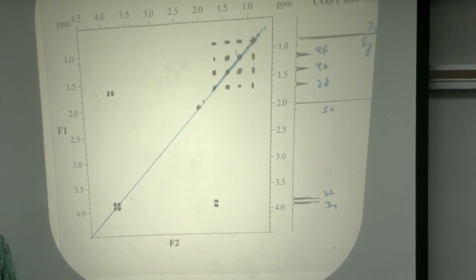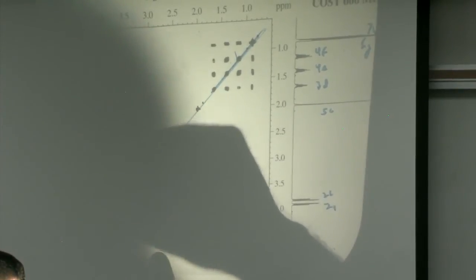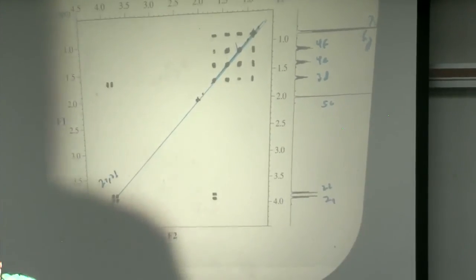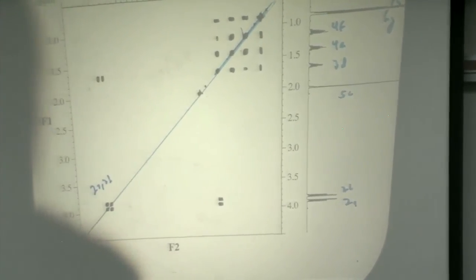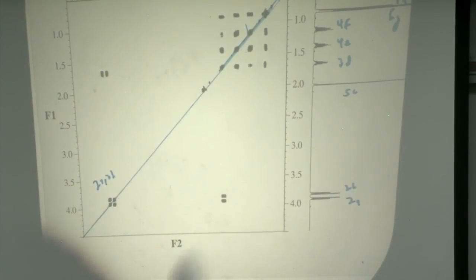All right. Now we're ready to look at our cross peaks. 2A crossing with 2B. I'm taking the 2A and the 2B diagonal. They're crossing with each other. Normally I go up and over, but here, because they're all on this side, I go over and over.